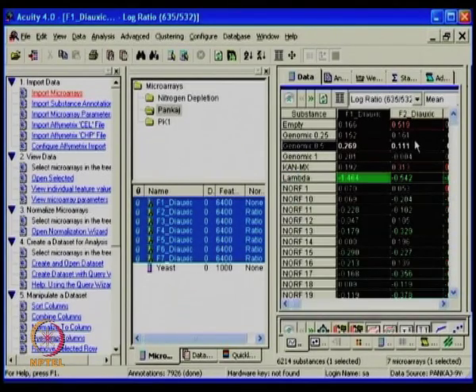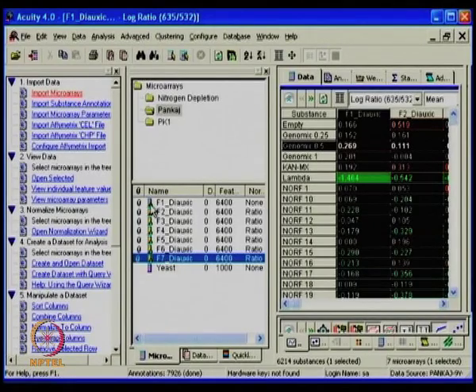Before going into this, let me explain an important factor here. What does each image mean? If you carefully look, it may not be very clear, but this one is a little purplish in color and the other ones down below are a little reddish in color. The purple one means that the data is not normalized. The red color means that the data is normalized, and the little green dot you are seeing tells me that I have a JPEG image which I can see down here. So it gives me connectivity of what is happening just by visualization.